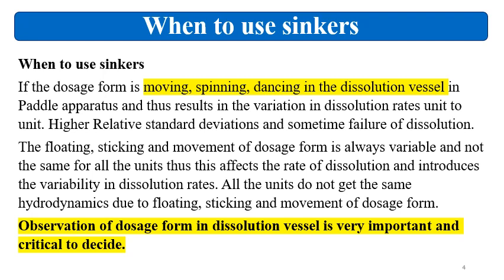So if your formulation is showing movement like spinning, moving or dancing, that time every time when your batch is made and it is tested, every time the different results will be there, and it will be very difficult to decide the batch when you are going for the pilot bio or pivotal bio or for releasing the batch in the QC.